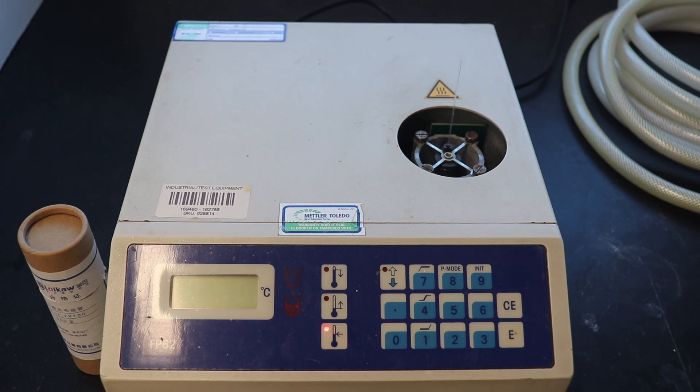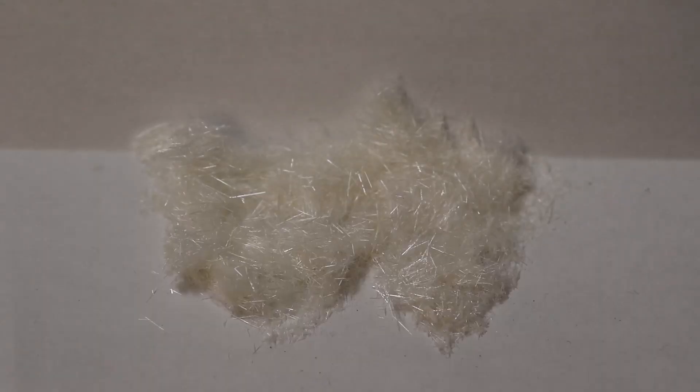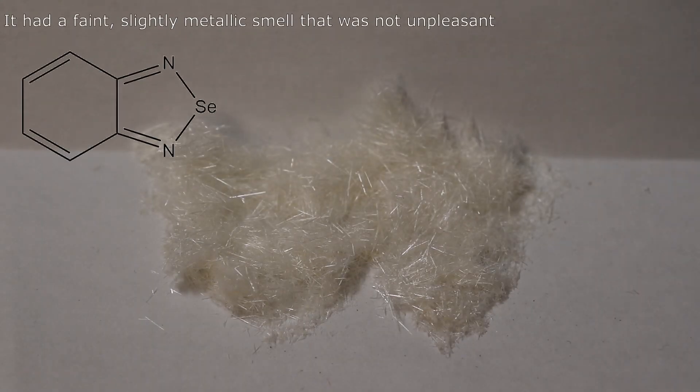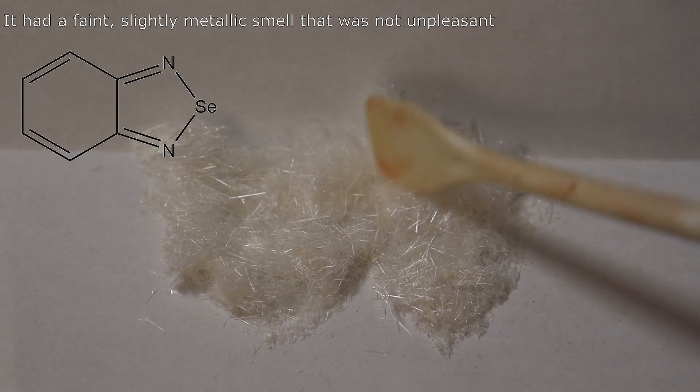The theoretical melting point is 73-74 degrees Celsius, and I got 73.7 degrees Celsius at a heating rate of 1 degree Celsius per minute. So we have in fact made our selenium-containing heterocycle.